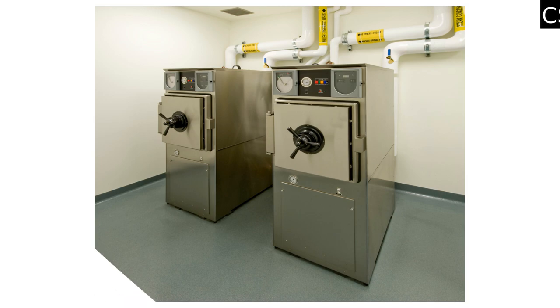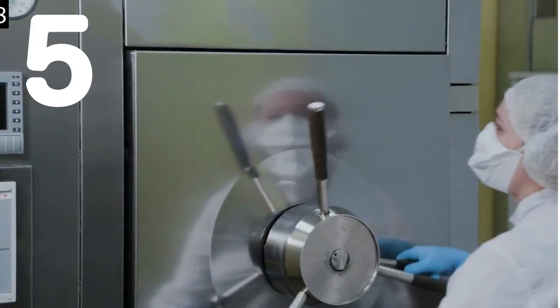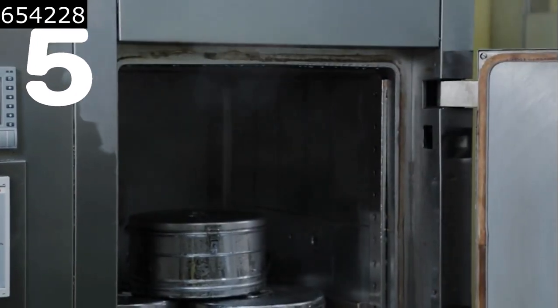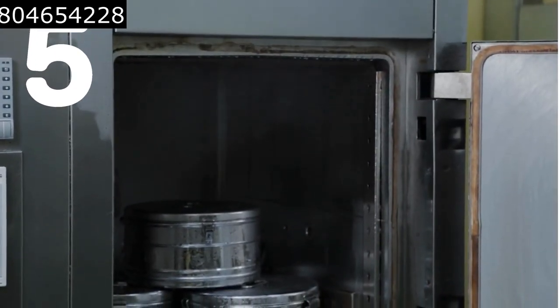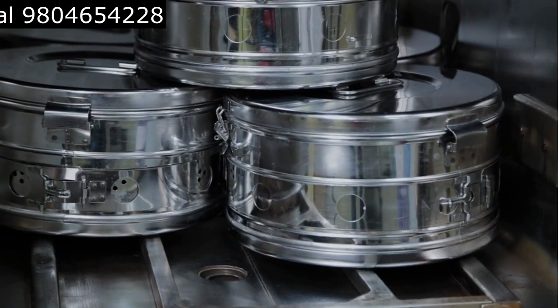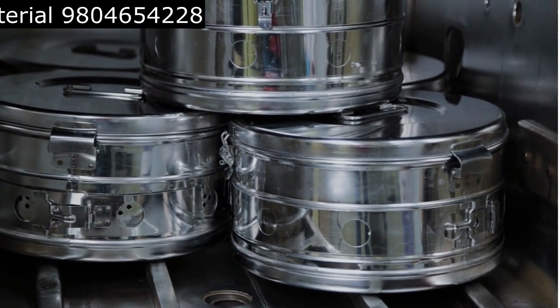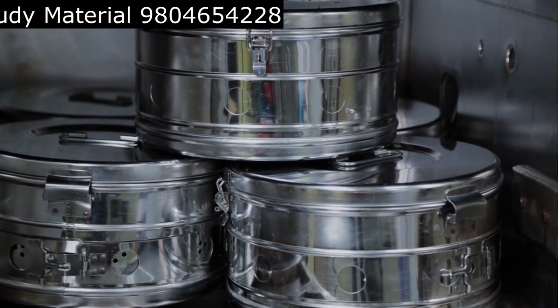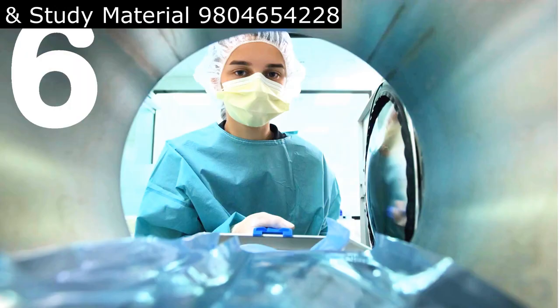Step 5 is cooling down and removing items. After the sterilization process is complete, the autoclave will begin to cool down. It's important to let the autoclave cool down completely before attempting to remove the items inside. Once the autoclave has cooled down, you can safely remove the sterilized items.